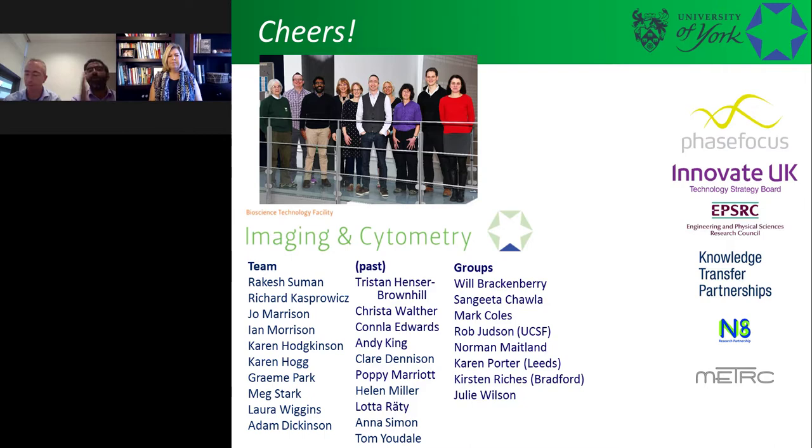That is quite an alarming statement sometimes, but after you've acquired the image, we have the data to refocus that image. So in fact, there's never a frame out of focus. Your microscope, your objective can drift over time, but we'll always regain that focus post-acquisition. Yeah, so I think the key thing there is we're not z-stacking. We're not moving the z-stage to do it. We take the one image, and it's the virtual focusing afterwards.